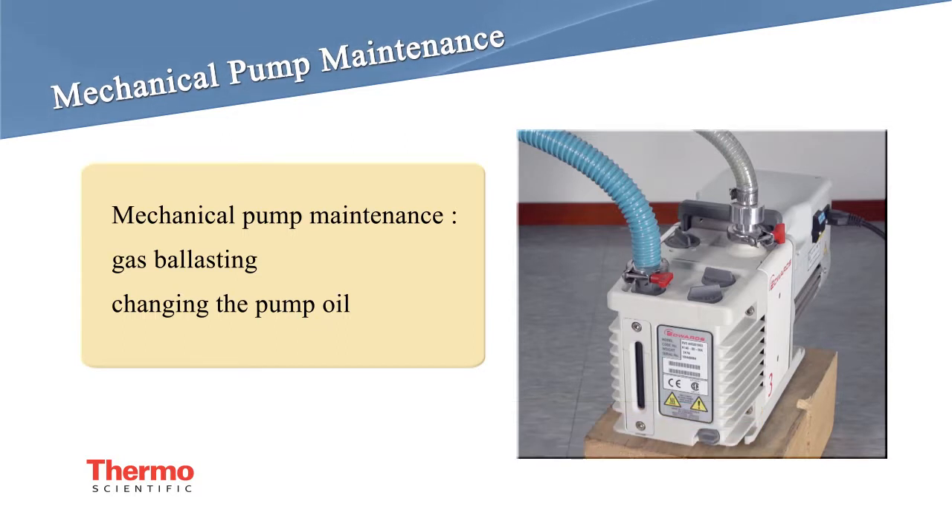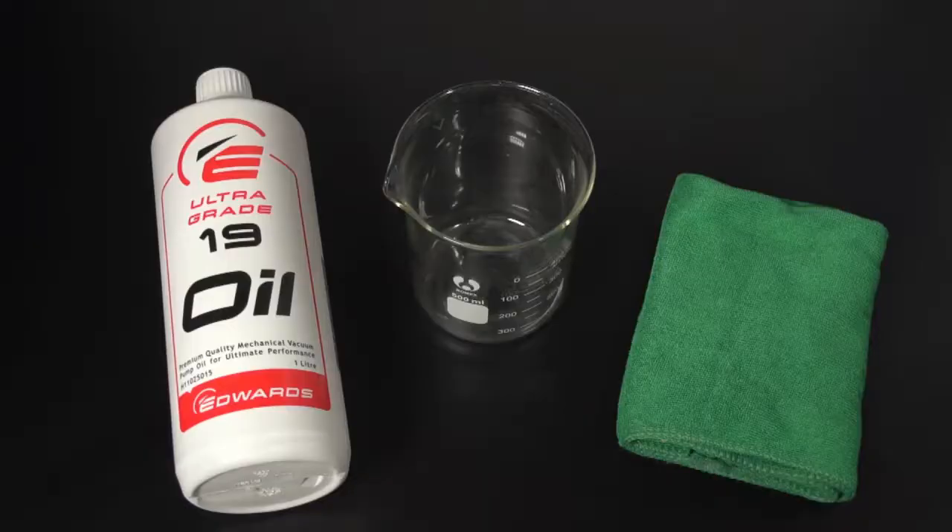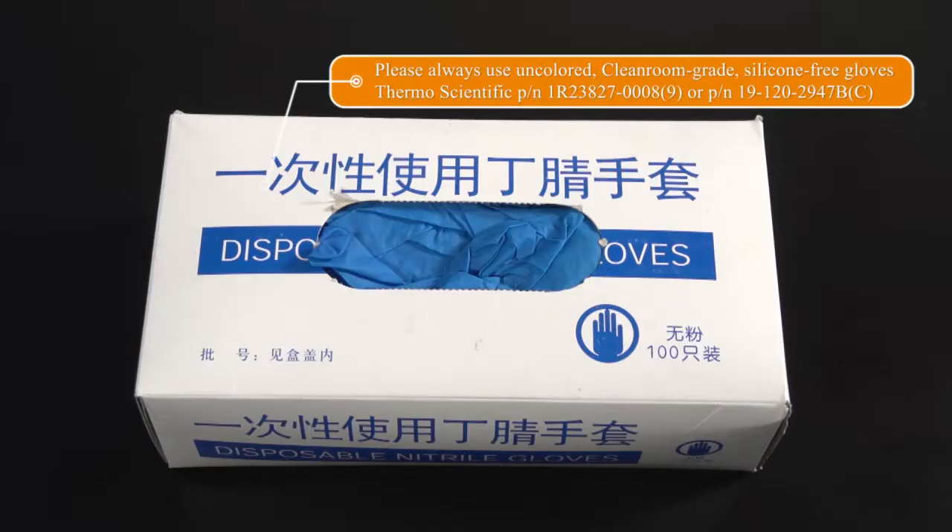Mechanical pump maintenance includes gas ballasting and changing the pump oil after the pump has been used for a while. You can visually see air bubbles in the pump oil glass window, which will shorten the life of the pump. Therefore, ballasting is done to remove the air bubbles or other chemicals out of the pump oil. Tools and materials needed: pump oil, 500 milliliter beaker, cloths, and powder-free gloves.